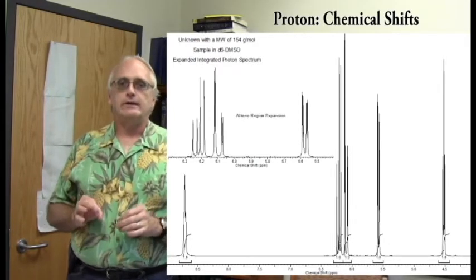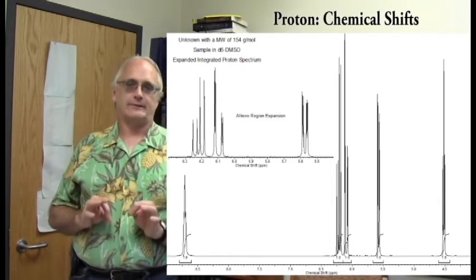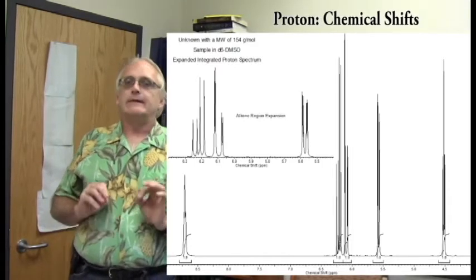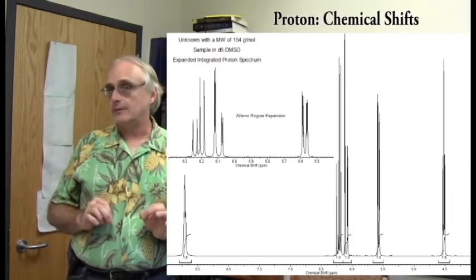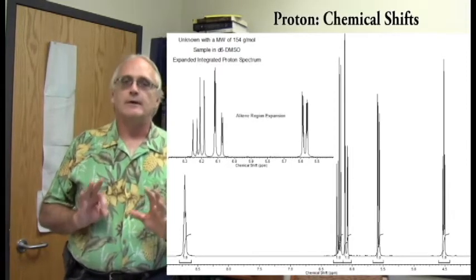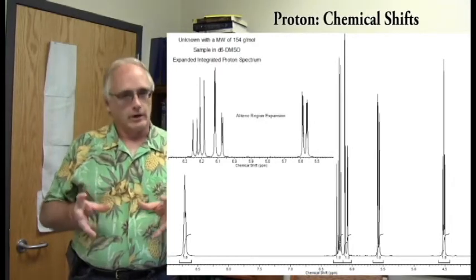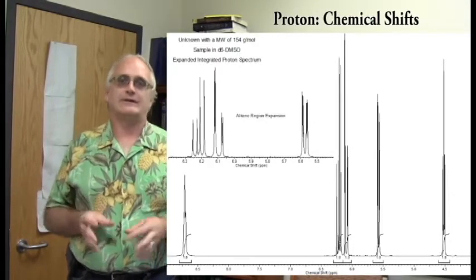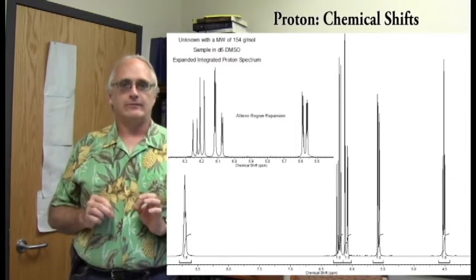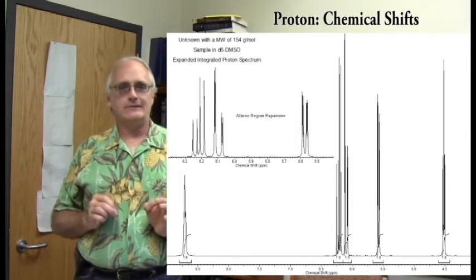We do see a set of peaks that have a beautiful chemical shift for an alkene here between 5.5 and 6.5 ppm. They do seem to have an interesting coupling pattern, but we're not going to get ahead of ourselves. We'll look at that in a moment, but right now we are inventorying our chemical shifts only, and we're going to call these the chemical shifts, potentially an alkene region. And then we have this last one over here at 8.7. Now that is pretty far downfield.